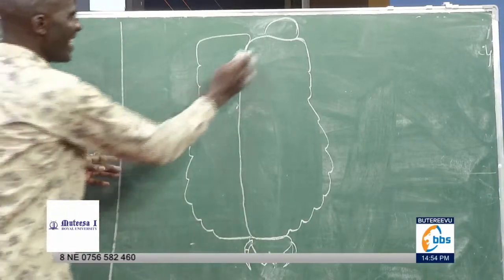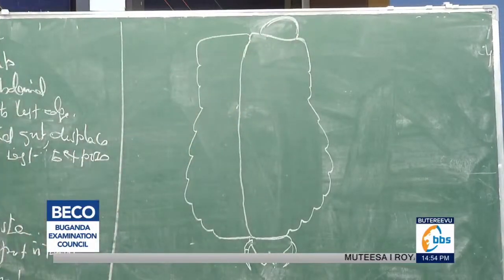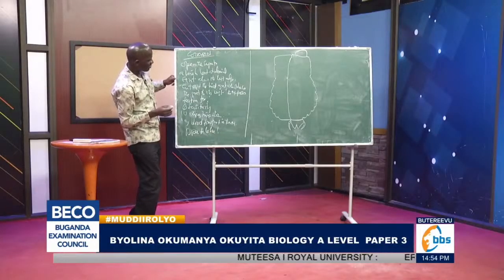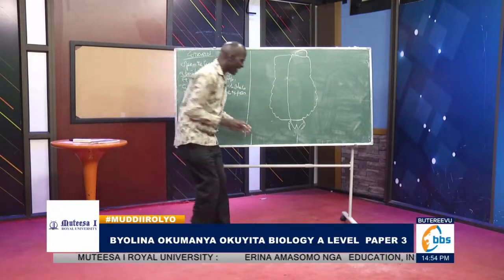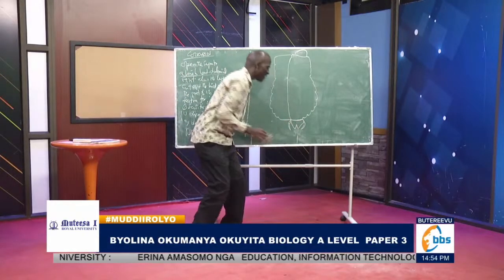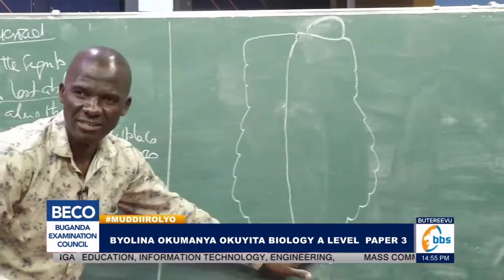I said we are opening structures that are anterior. I mean segments that are anterior to the last abdominal segment. Anterior. The last abdominal segment is the last tergum here. That would mean I'm not asking to open here.